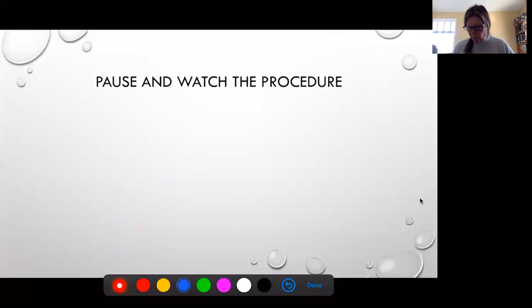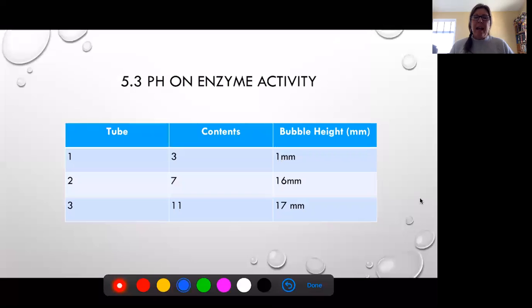All right, now I'm hopeful that you did in fact watch that. And then we have our results. This is another case where usually like half of my class will get the neutral being the highest for them, and then the other half will be the base. And again, I kind of suspect the ideal pH is probably in between 7 and 11.